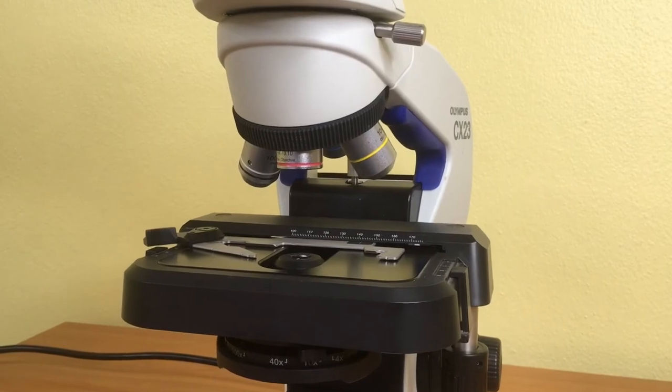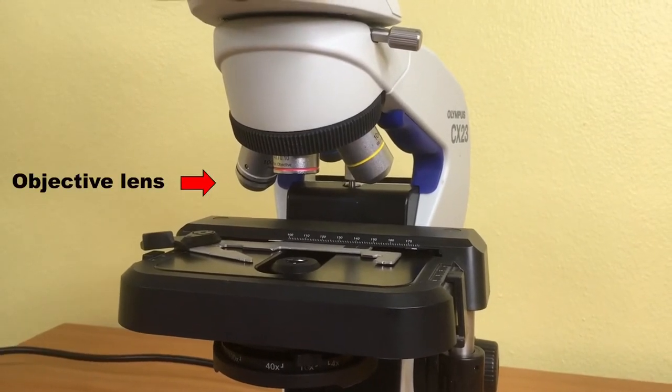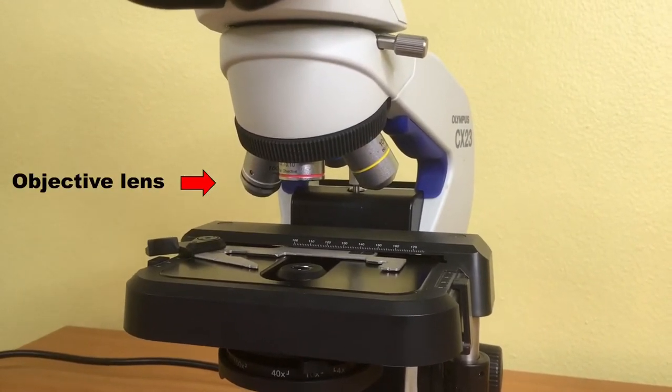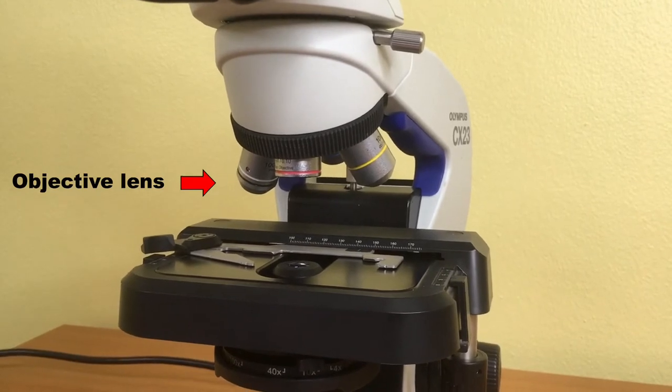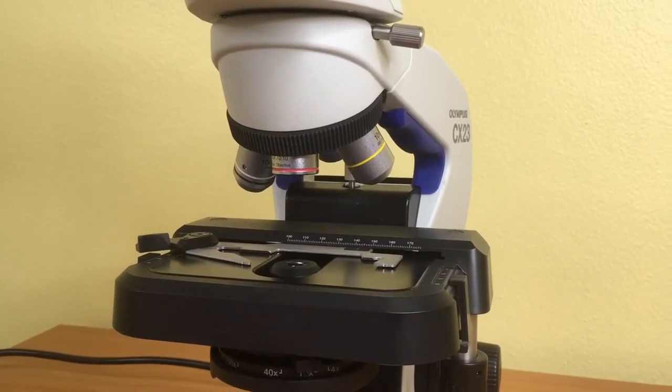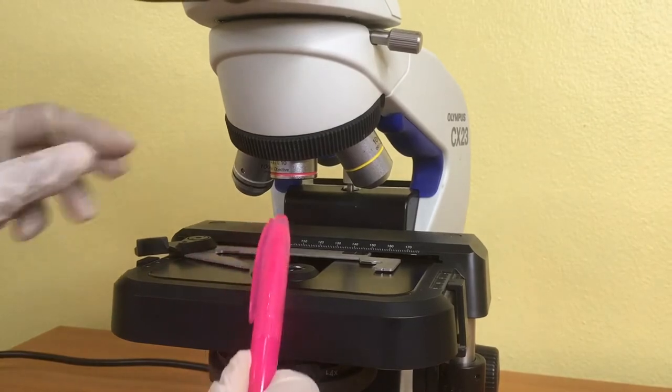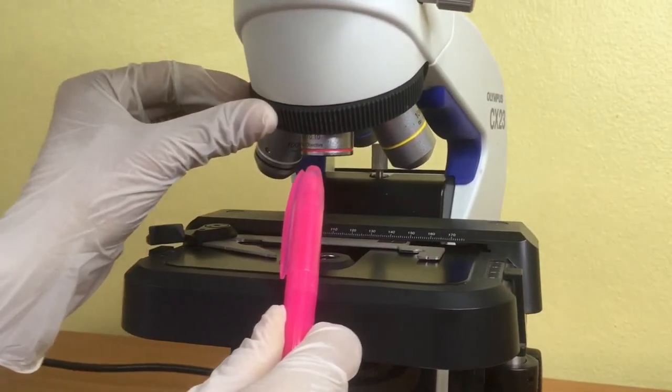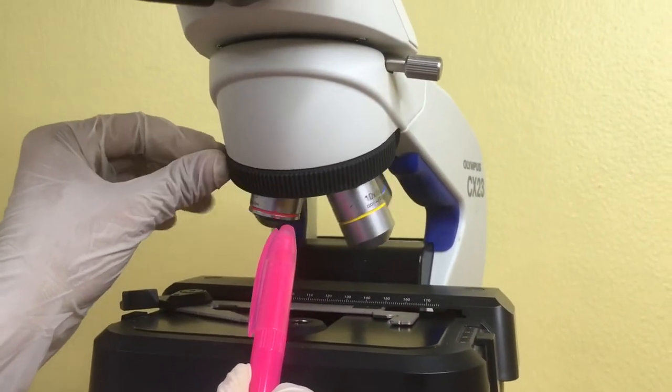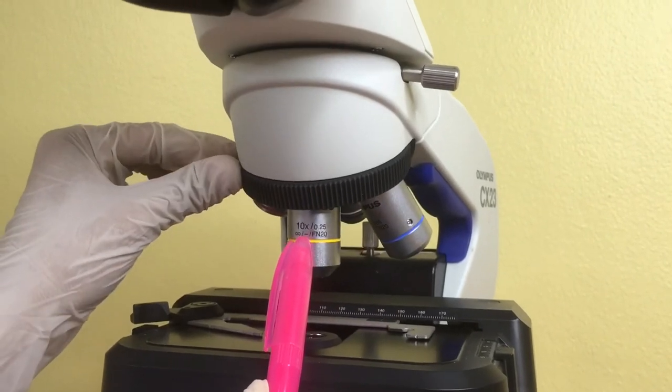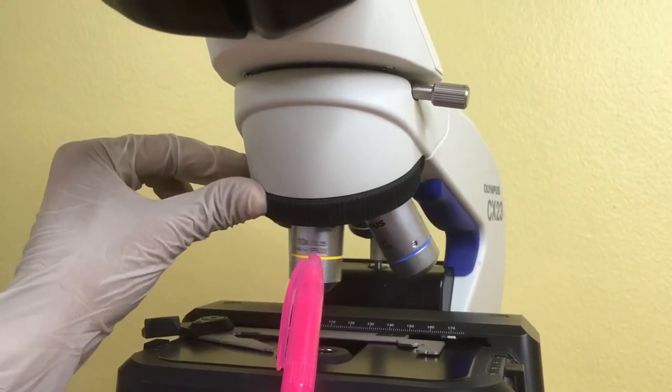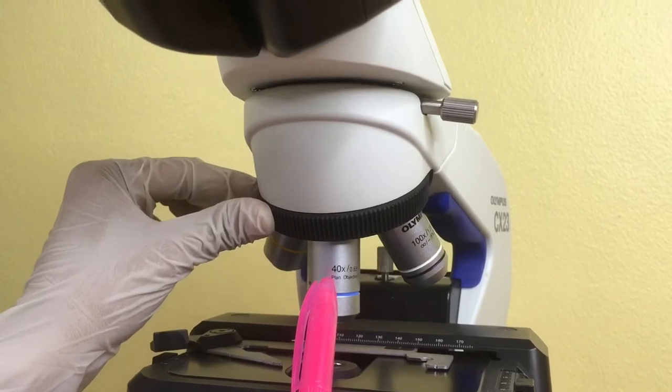Next, the objective lens. The objective lens is a set of lenses closest to the specimen. A standard microscope has 3-4 objective lenses ranging from a low power, a medium power, a high power, and an oil immersion lens.